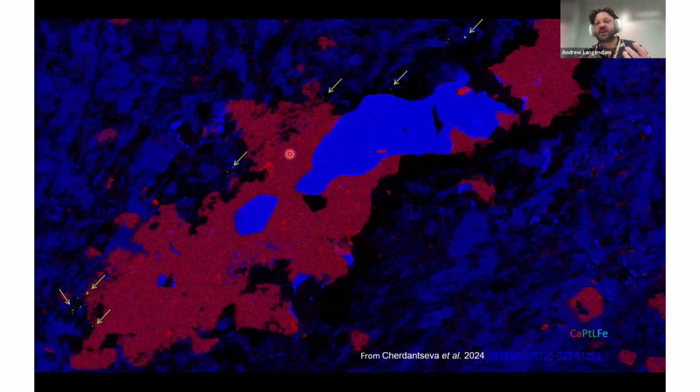And when talking about trying to find those single instances of very high intensity or high concentration of a particular element, this is a study that was looking at carbonatite melts from Inner Mongolia to try and see if they had platinum group element nuggets in them, PGE nuggets. So we were able to scan very large areas very, very quickly.